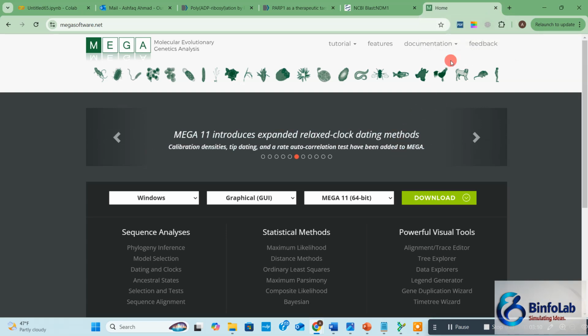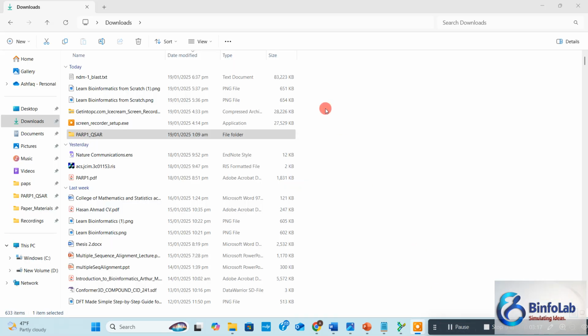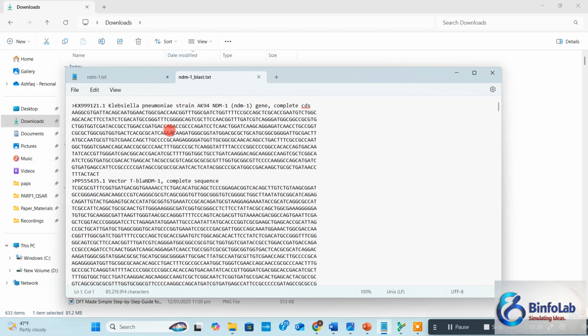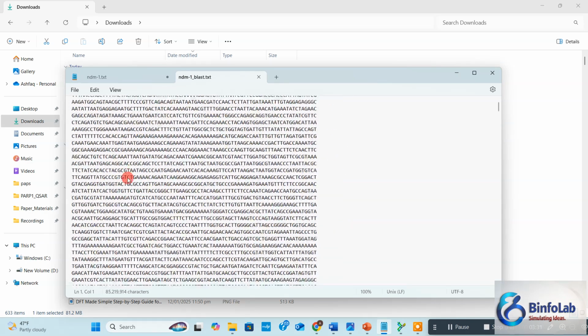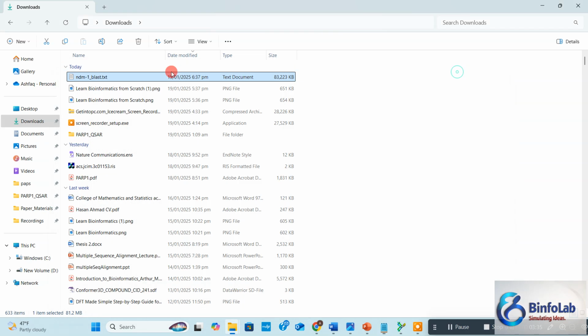So now let's explore these programs, how they will work on our data. I assume that you have watched part 4. This is the file we downloaded in part 4 and it contains all the sequences downloaded from BLAST.